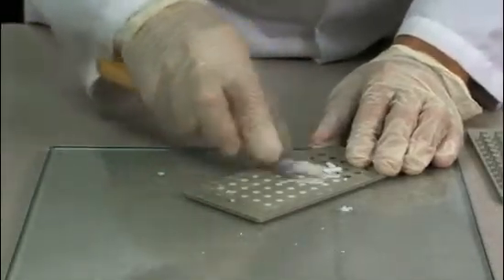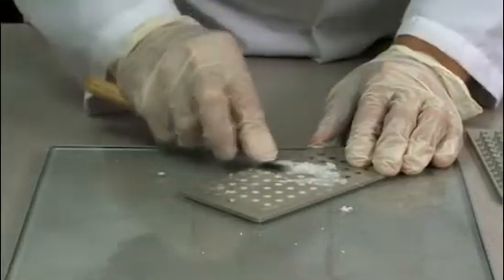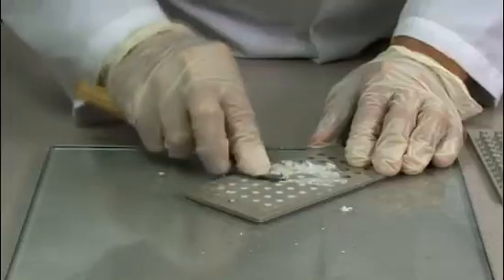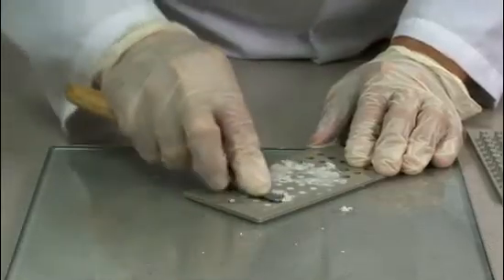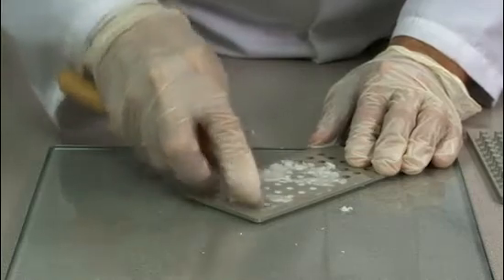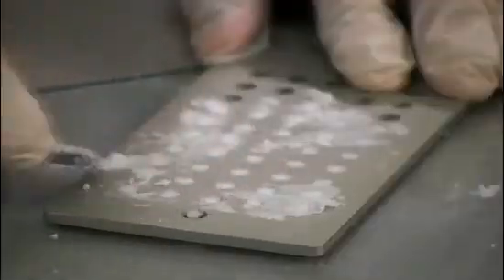It's important to move quickly when you do this because the alcohol is evaporating the solvent and the powder becomes much more difficult to use. It's also a good idea to look back at the tablets where you have left, and if you see obvious gaps, go and fill them in.